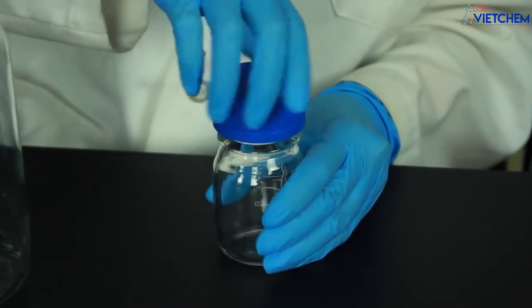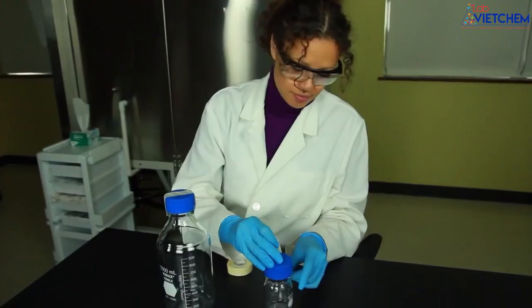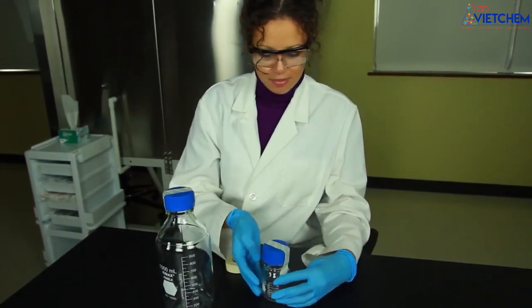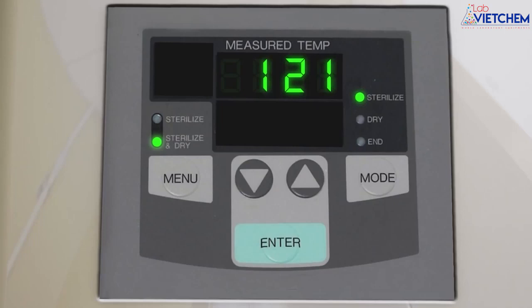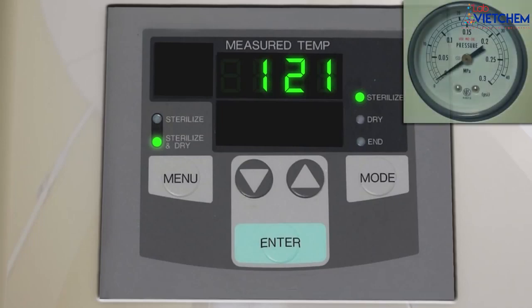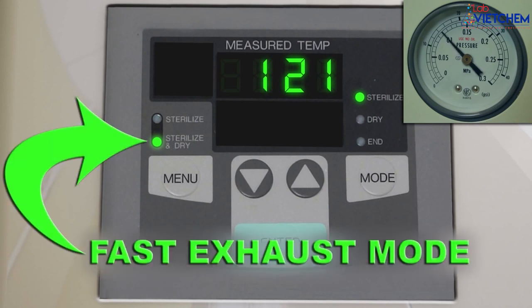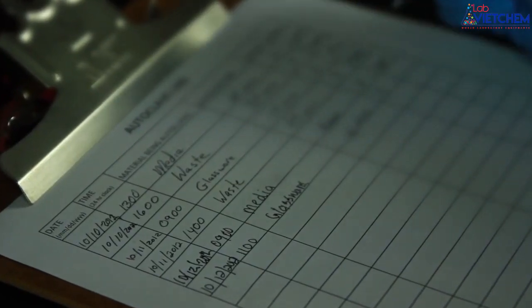Tighten the cap, but then loosen it about halfway. Place the autoclave tape over the lid and put the bottles into the basket. Set the autoclave to 121 degrees celsius, 15 psi, and a 20 minute run time. Select the fast exhaust mode. Complete and initial the log.